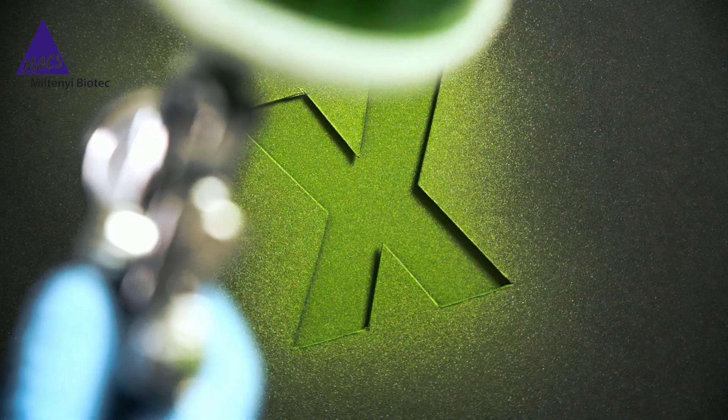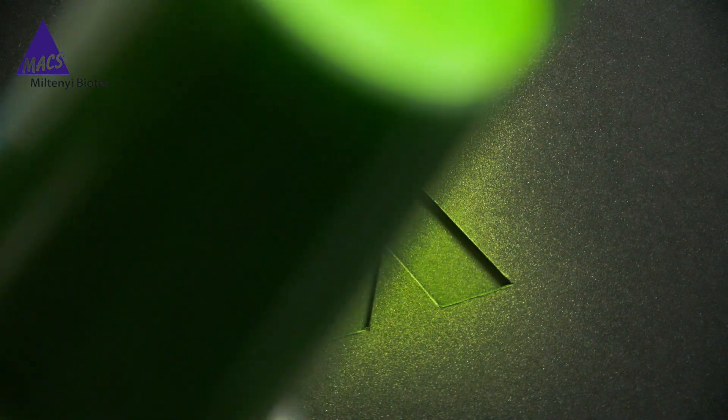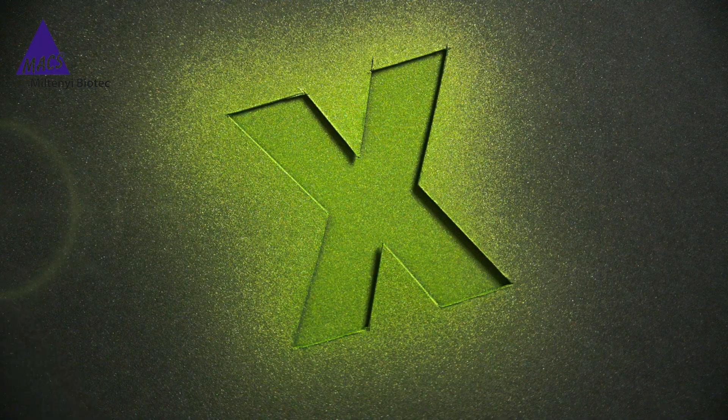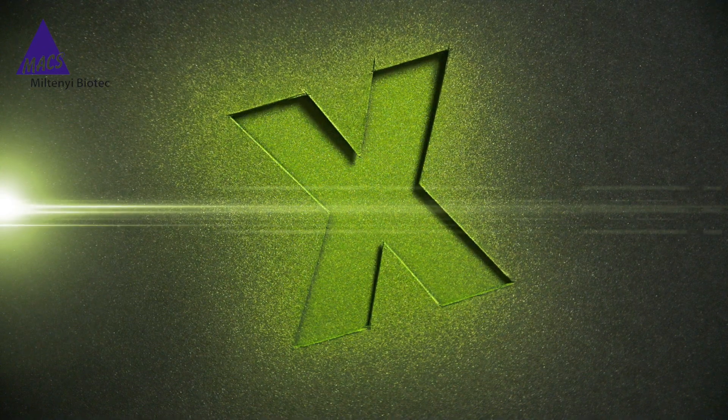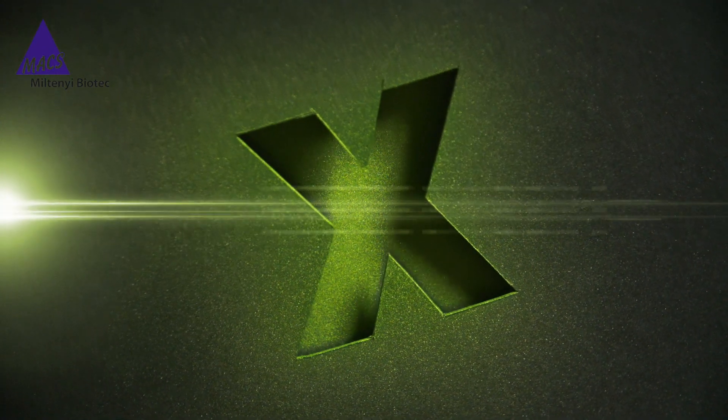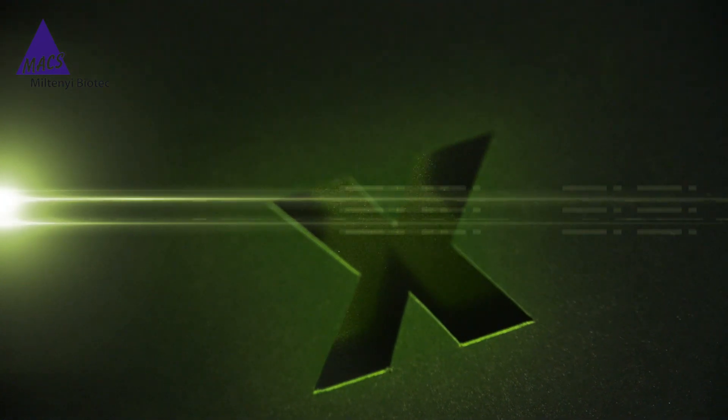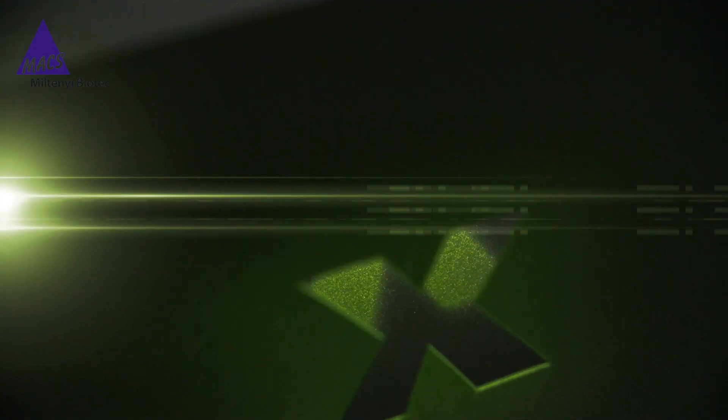What would that mean for your lab? How would that change your research? Miltonie Biotech proudly presents The Max Quant X Flow Cytometer.